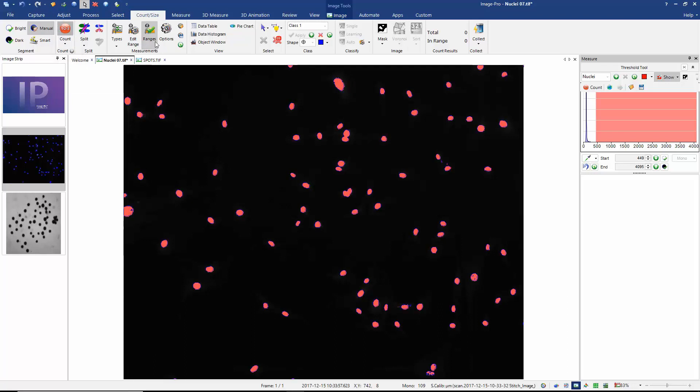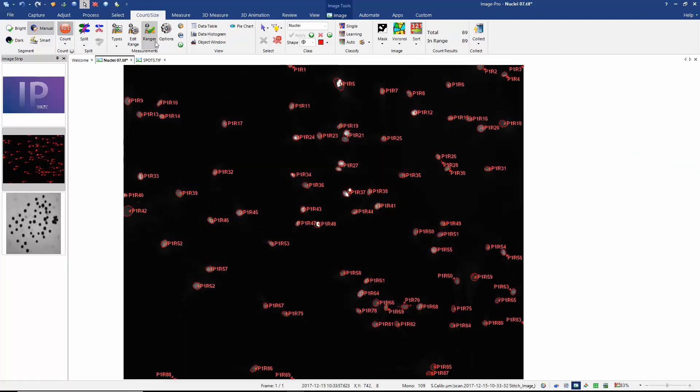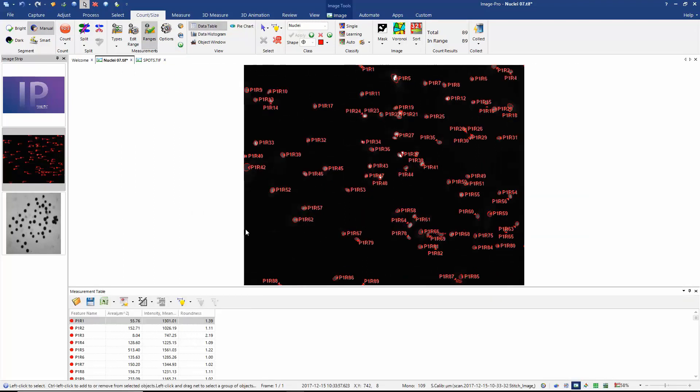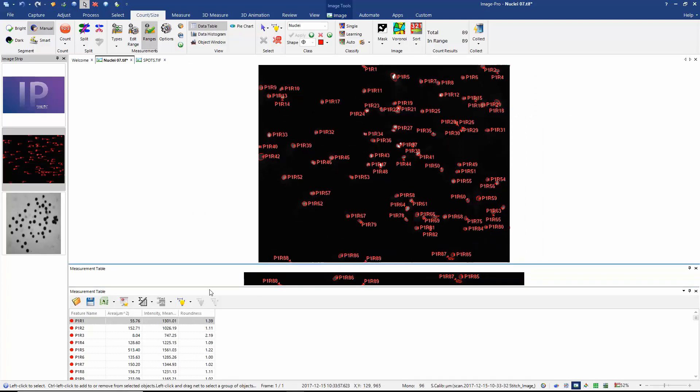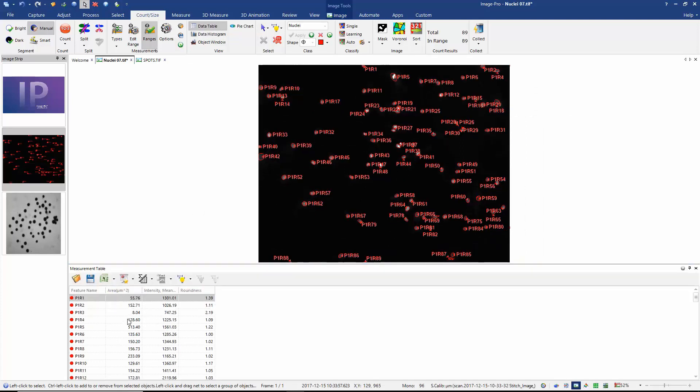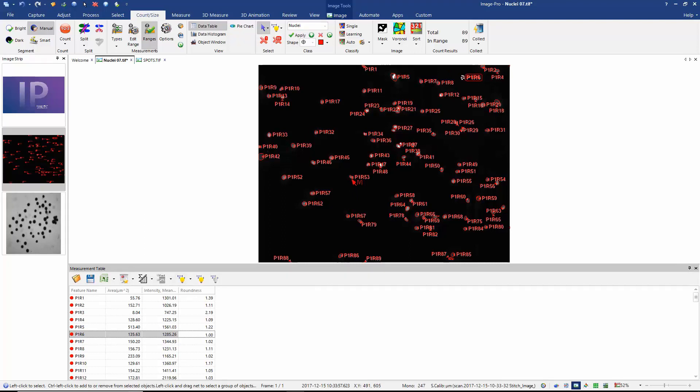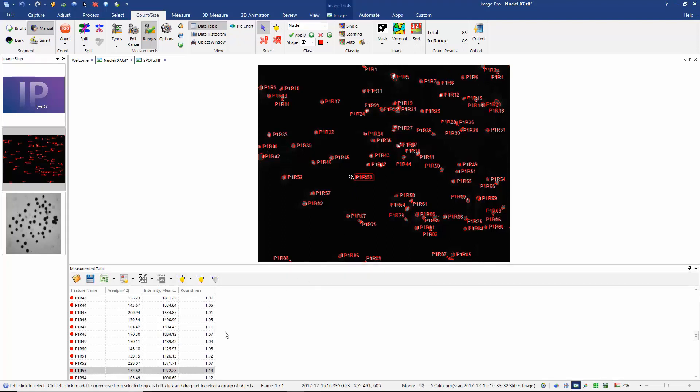So here now ImagePro actually executes a count. And if I show my measurements table, you can see that we have a measurement table that shows all of the types of measurements I wish to make. So we can see we have the area, the mean intensity and the roundness. And we have bi-directional feedback here. So if I select an object in the table, it gets highlighted in the image. And conversely, if I select an object in the image, its measurement row in the table is selected.